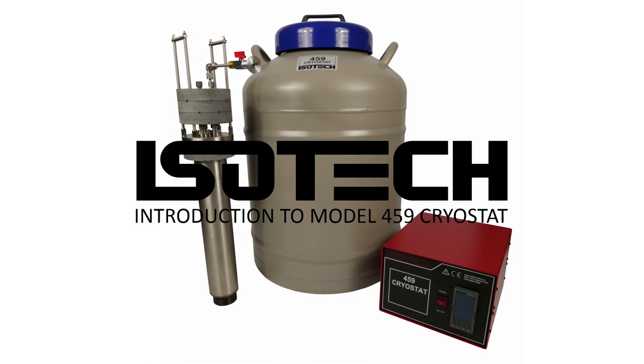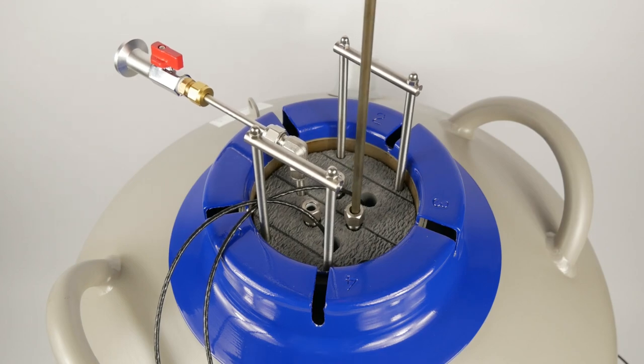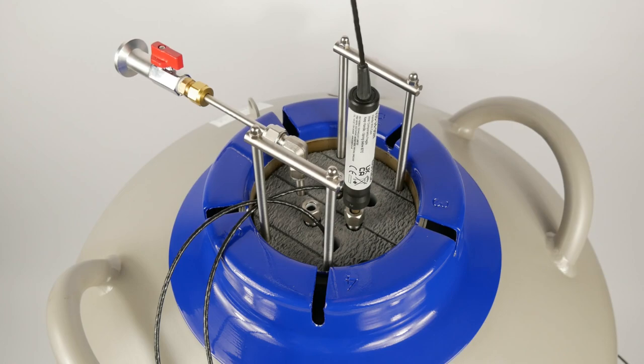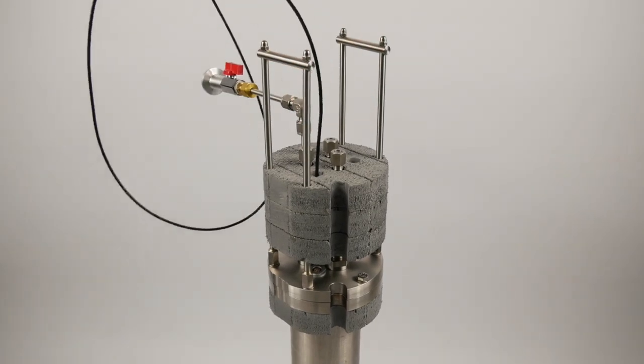Welcome to our introductory video looking at the Isotech model 459 Cryostat. This device is very useful to calibrate from minus 80 degrees to minus 180 degrees C, and fits in nicely between the liquid nitrogen point at minus 196 degrees and the lowest temperature stirred liquid bath at about minus 80 degrees C. The system consists of a number of parts.